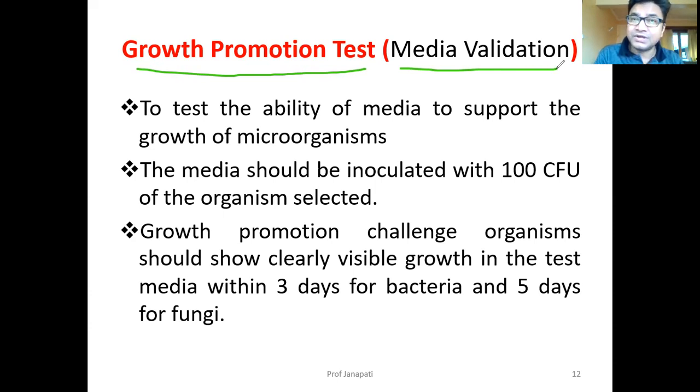And the media should also help in the growth of microorganisms, if microorganisms are present in sterile products. In order to check that, this media should help them grow. So that's why we do the growth promotion test. This test is used to check whether the media supports the growth of microorganisms or not.